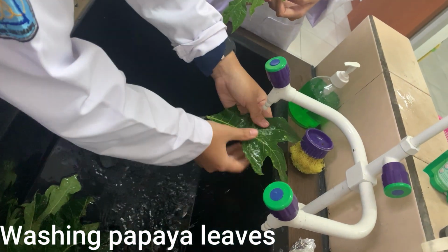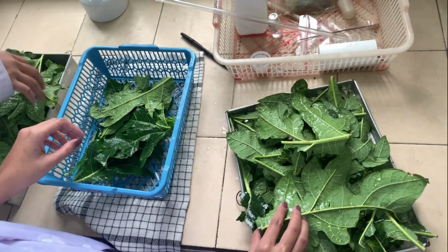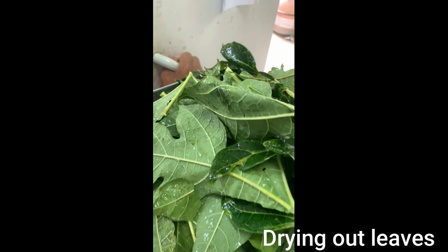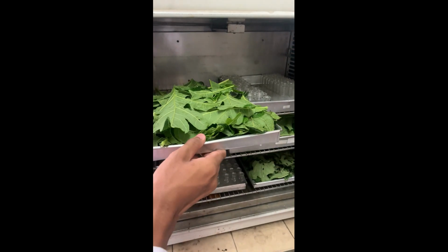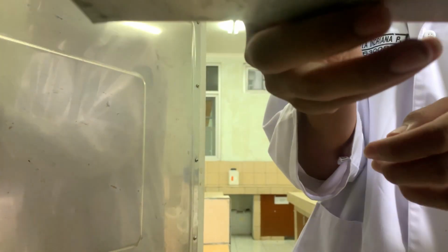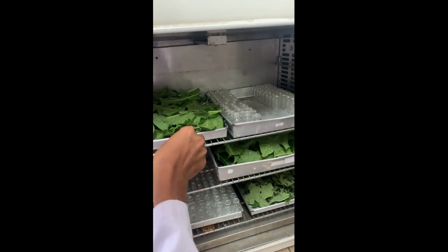The first step was to clean the leaves so that no impurities are involved. Then, arrange them on a baking sheet. A few moments later, put it in the oven at a temperature of 37 degrees Celsius because alkaloids will be damaged at high temperatures. Put it in the oven for 3 days.